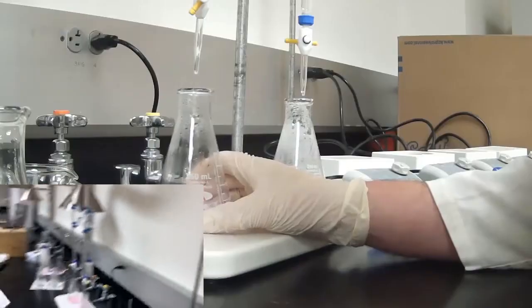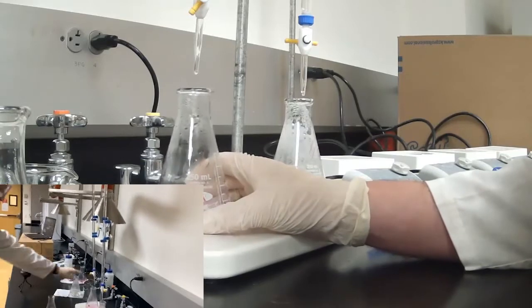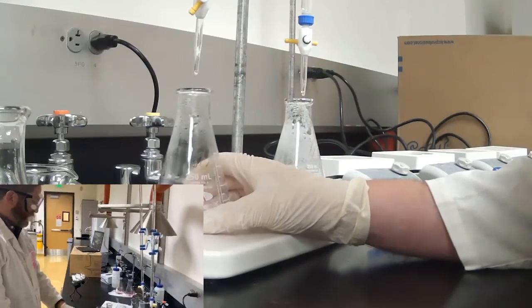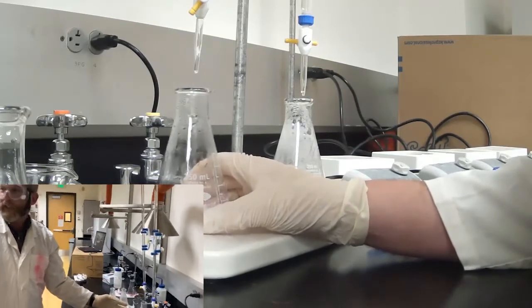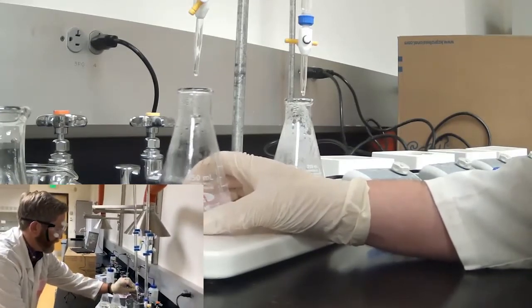Okay, so we'll go ahead and get that set back up. And then again, as before, we're just going to add this dropwise until we see the same type of color change. These particular tablets, because they were uncolored, you won't have a masking agent. Sometimes if you have a colored or like mint Rolaids, it will also cause another color change, so I try and stay away from those because then it makes it harder to compare to our outcome with these previous samples.